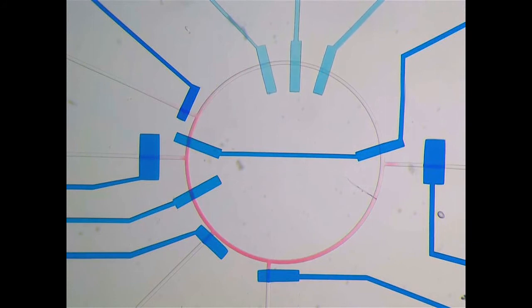After loading equal amounts of sample and buffer into the ring, the two fluids are mixed by activating peristaltic pumps.